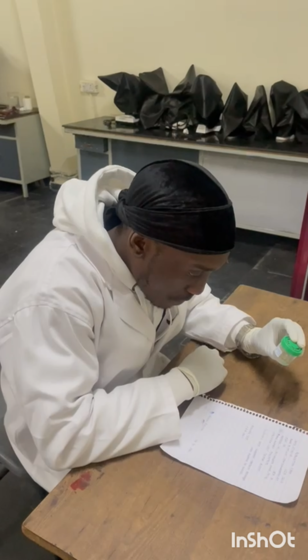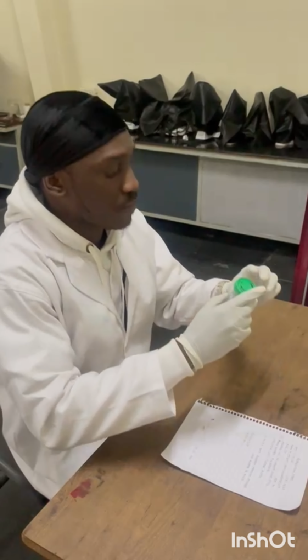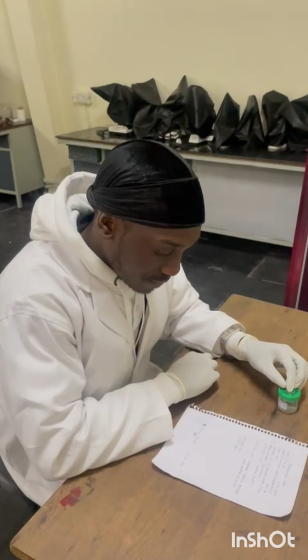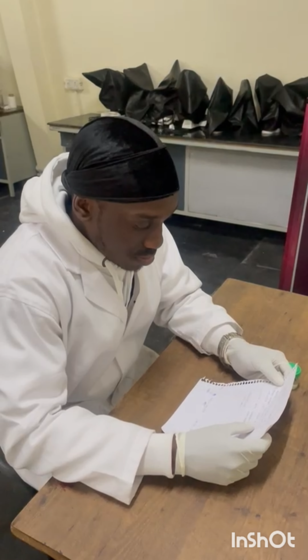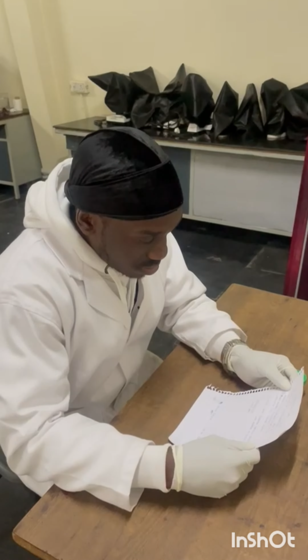4. Regulatory non-compliance. Failure to follow proper sample reception procedures can result in regulatory non-compliance, leading to accreditation issues or legal consequences. 5. Reputation and trust. Repeated errors and inaccuracies in sample reception can damage the laboratory's reputation and erode trust with clinicians and patients.